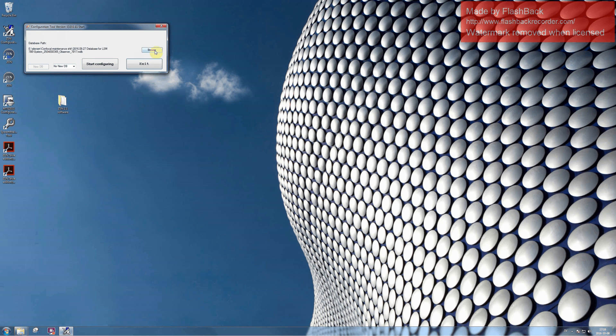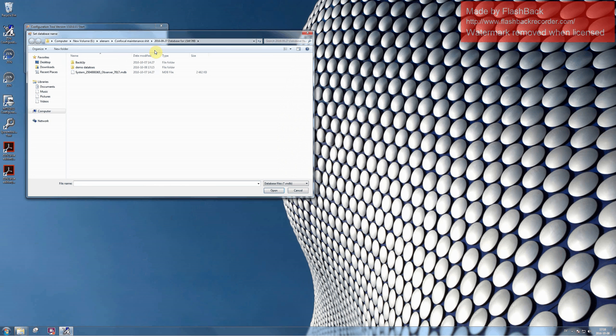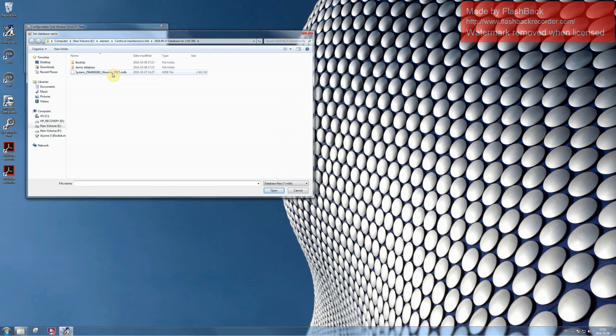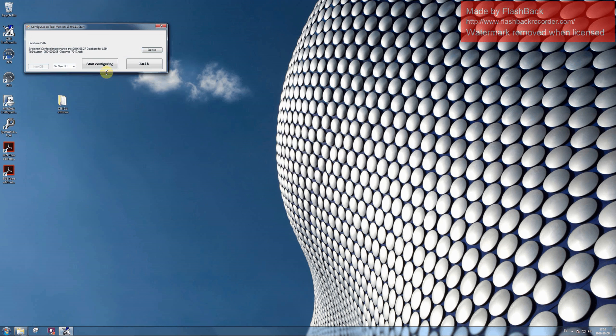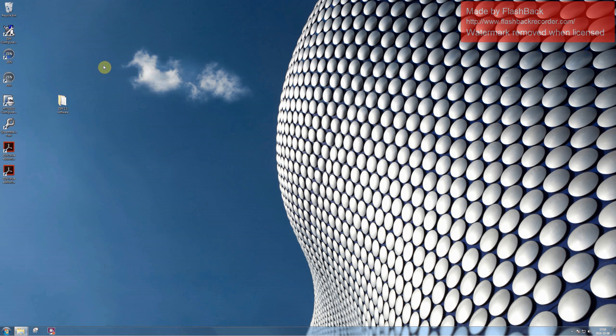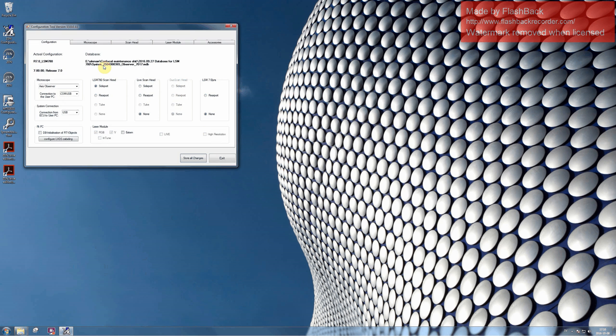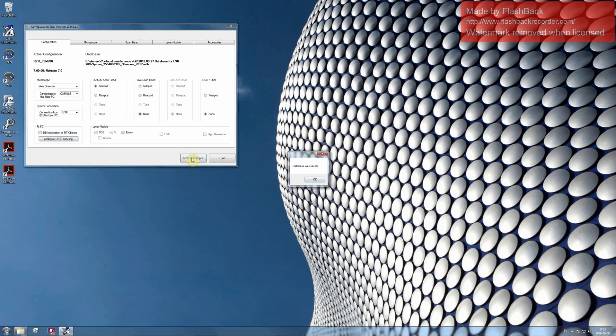Select the Browse option and pick the configuration for our Confocal Microscope. Click on Start Configuring and store all changes. You should get confirmation from the software that the database was saved.